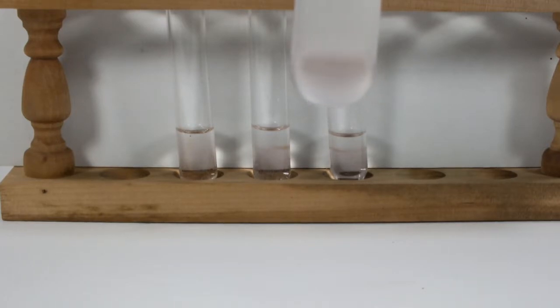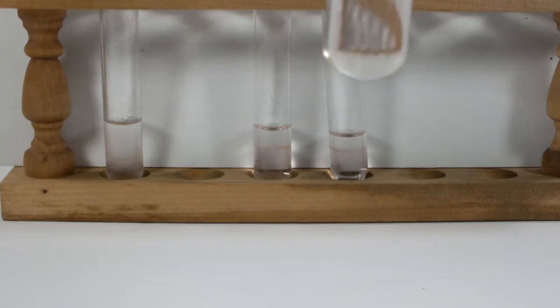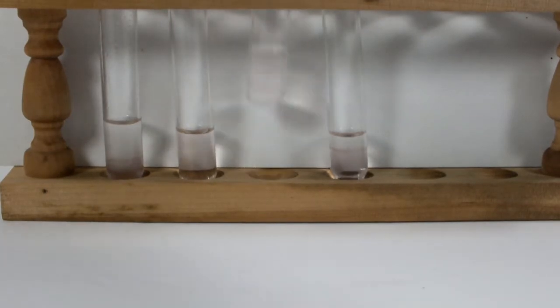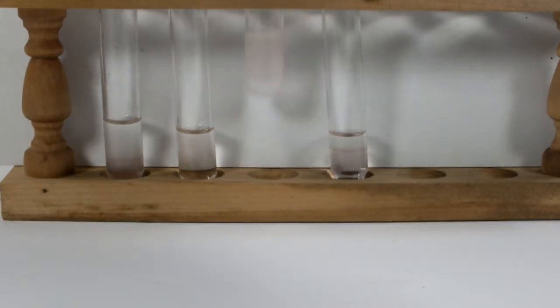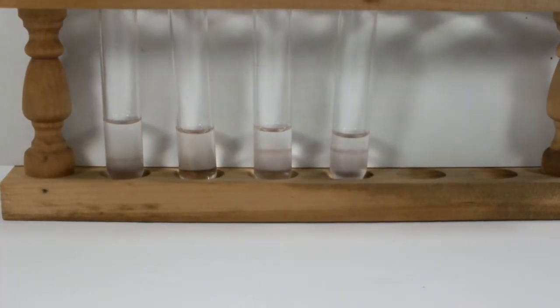This is kind of cool, because that's the second option when you have a mixed solvent. I said earlier that the solvents can mix and the salt falls out of solution — and that's the case with my potassium sulfate blizzard demonstration. However, if you add potassium carbonate to a solution of ethanol and water, it will dissolve in the water but not the alcohol. What was once a homogeneous solution of water and alcohol becomes a biphasic system with an aqueous potassium carbonate solution on the bottom and ethanol on the top. This principle is often used in organic chemistry to dry products, whether by washing an organic liquid with brine solution, or by adding dry magnesium or sodium sulfate to attract the water dissolved in the organic liquid. We can conclude that manganese sulfate does not dissolve in alcohol, at least not to any appreciable level.